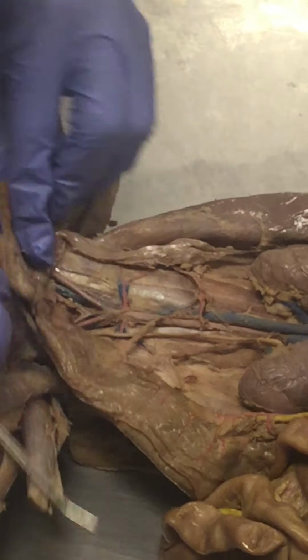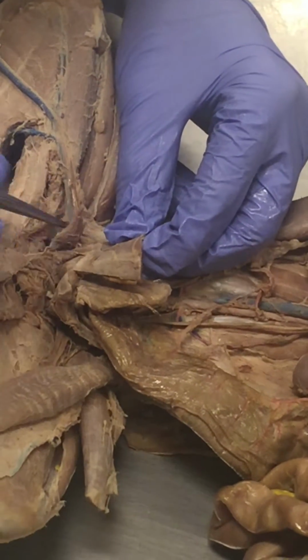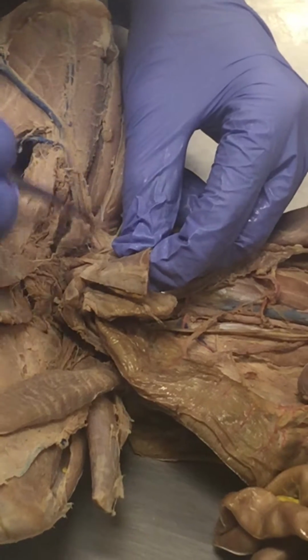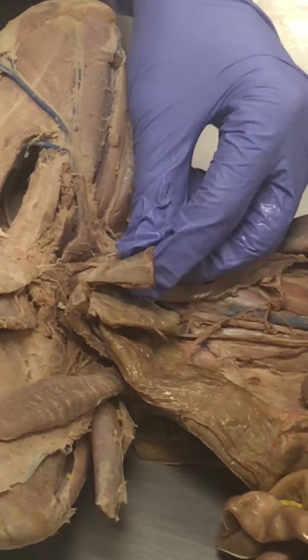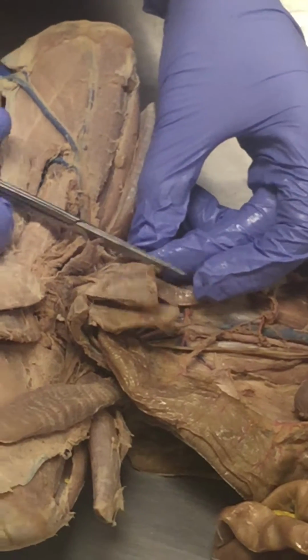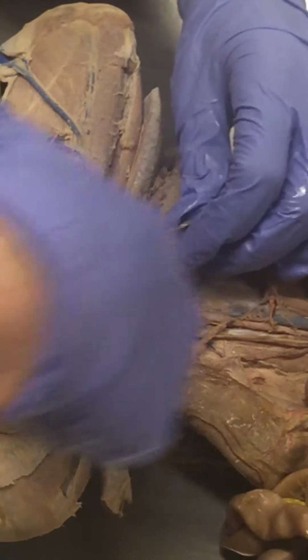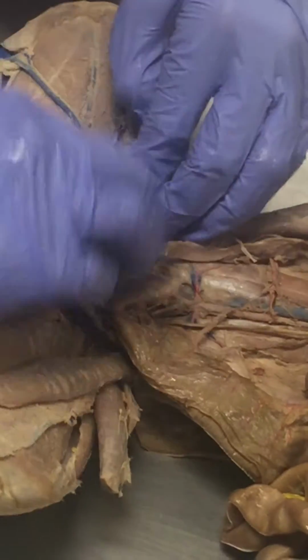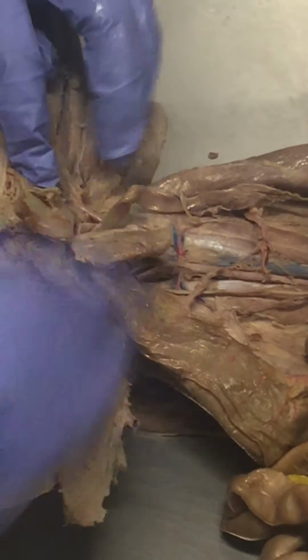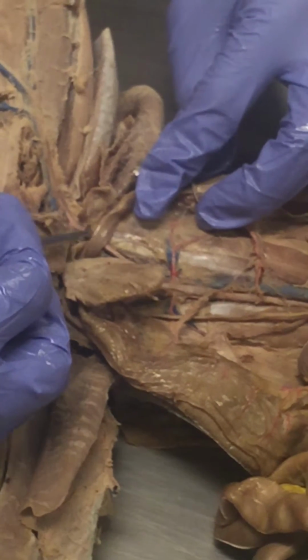Then what happens, we get to the outside of the body, which actually I kind of want to cut through here. I probably can because this isn't a boy cat. Okay. There we go. So right here, we can see our external iliac continues.